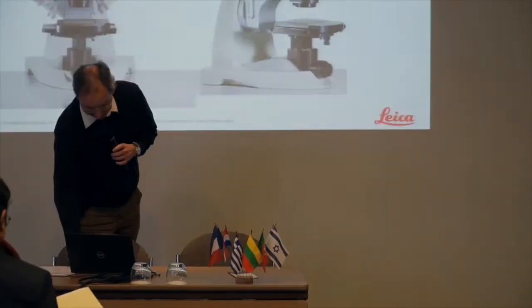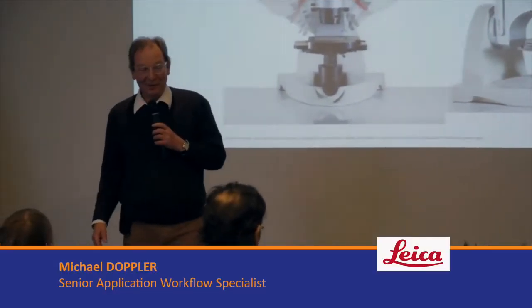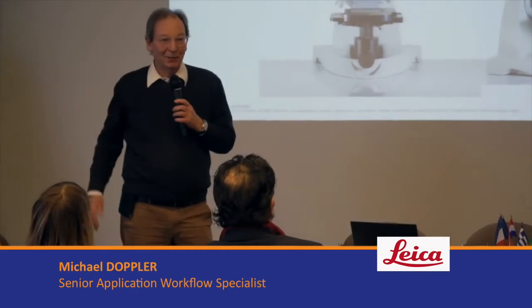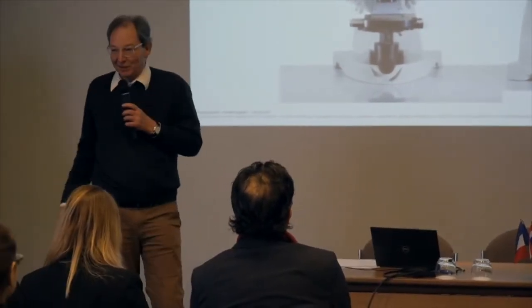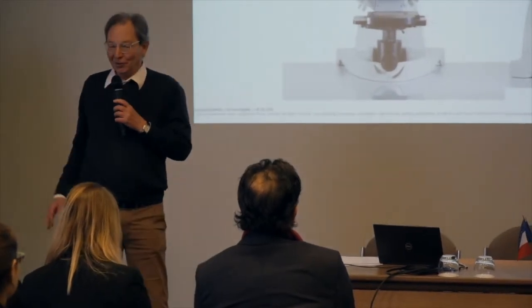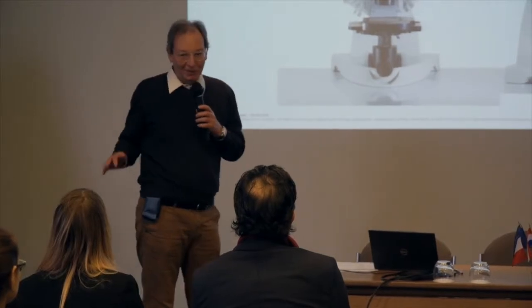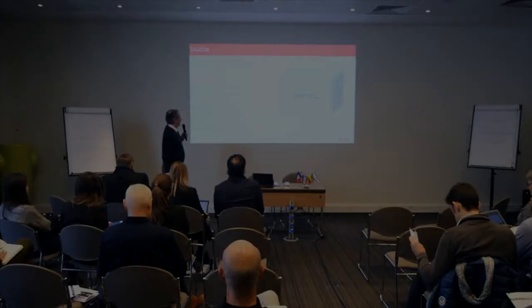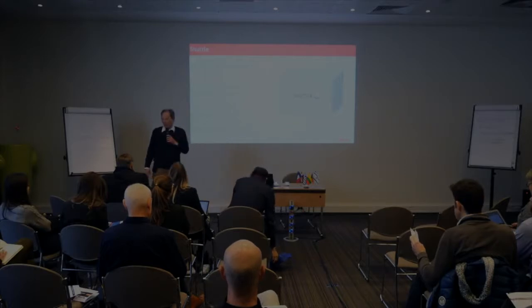Shuttle. Actually, this is what I wanted to talk about this morning, but with the specs that we heard yesterday, this instrument, as nice as it is in forensics, will not do the job. Even if we would do modifications on it, it will not do the job. I made this black box microscope there called Shuttle.